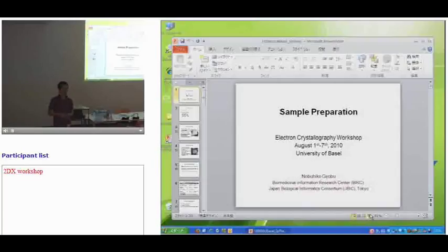Okay, so then when you have to freeze it, you have to use trehalose and glucose even for back injection. Yes. I usually first choose trehalose, but glucose may work, I think. My understanding was just in general, if you freeze, trehalose; if you don't freeze, glucose. What is other people's experience?